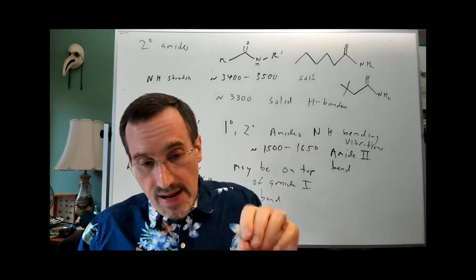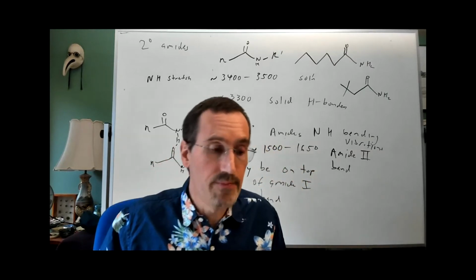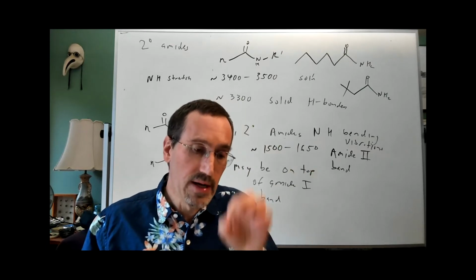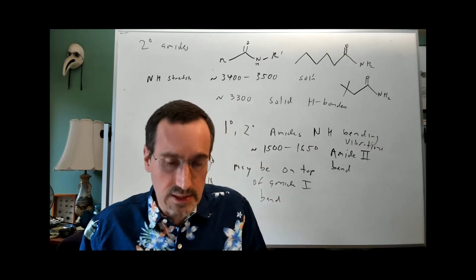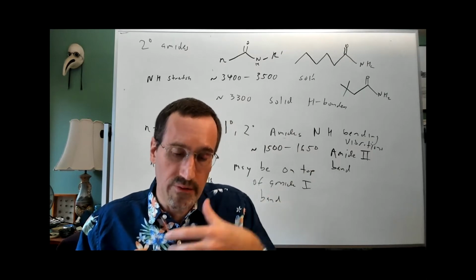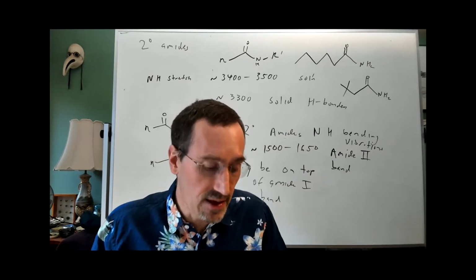Then your light passes through them, but you've still got tiny particles of your compound. So it's not dissolved or dispersed in the KBr in a way where the molecules are separated. In chloroform solution, the molecules weakly self-associate. If your solution is strong, you have more of them self-associated. If it's weak, you have less self-associated.